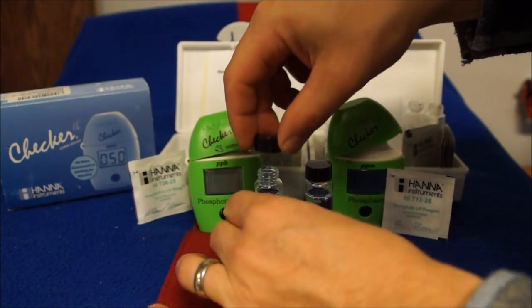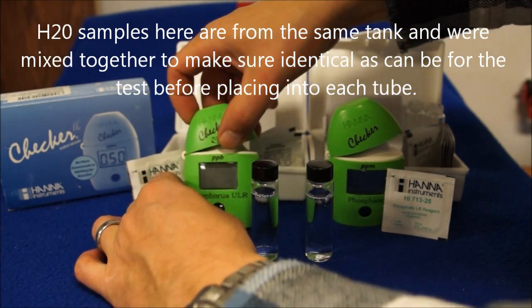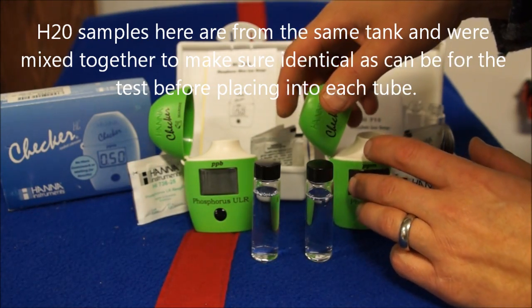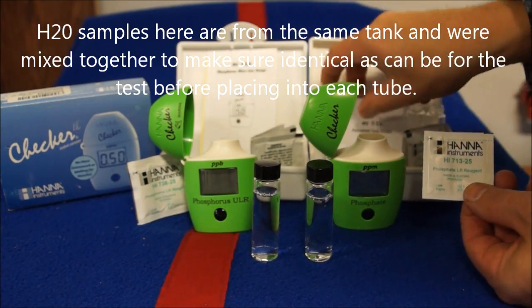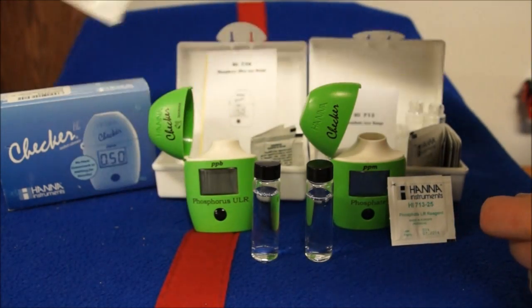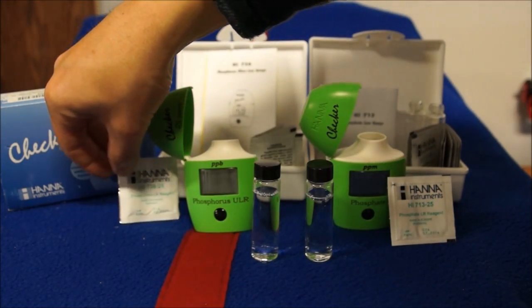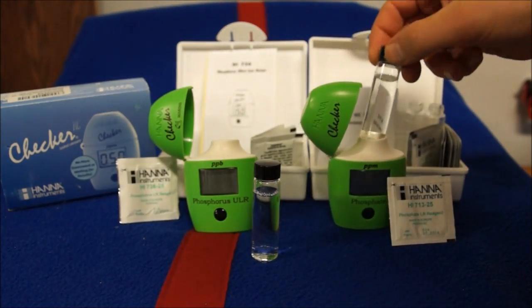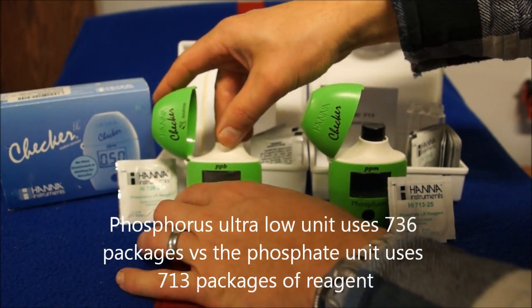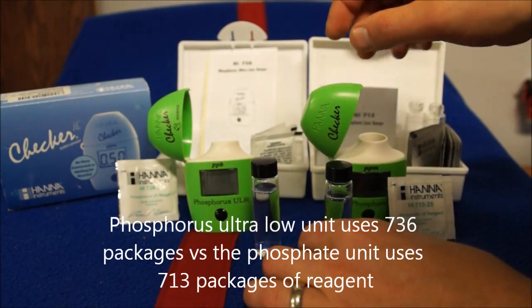The difference is very simple, and I tried to explain that in this side-by-side test. I took some aquarium water from my tank as the sample and we're going to run each test unit side by side properly. One measures phosphorus, the other measures phosphate. The phosphorus one uses a 736 packet, the phosphate one uses a 713 packet, so you cannot intermix the packages.